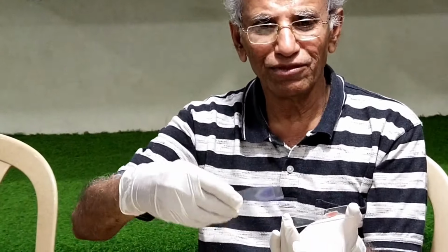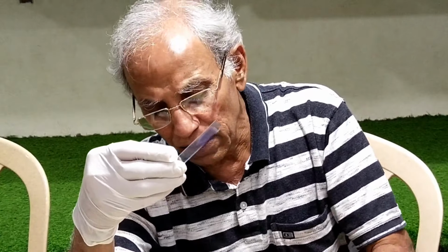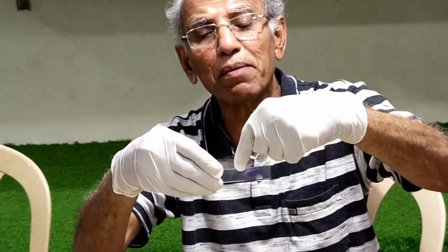And the white blood cells will try to migrate to the sides. So when Leishman staining is done, this seems to be done with a bigger drop of blood, of course, you can expect that if you want to observe the white blood cells, they can probably be observed on the surrounding areas.